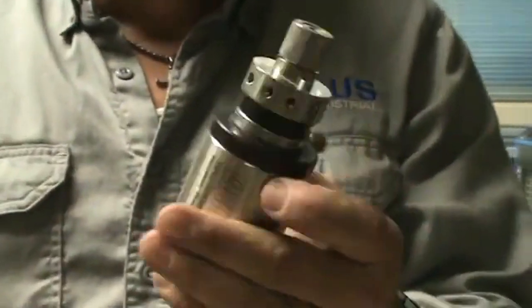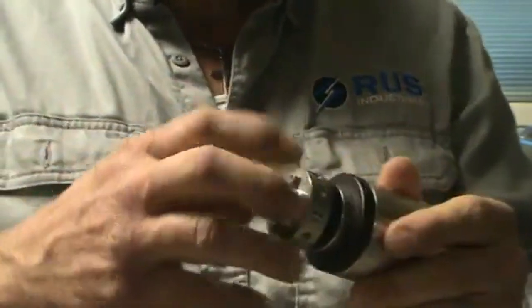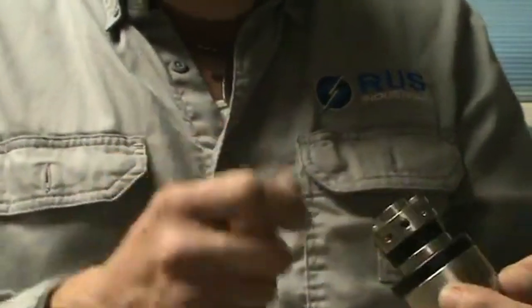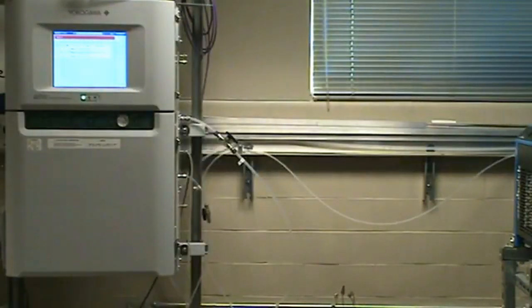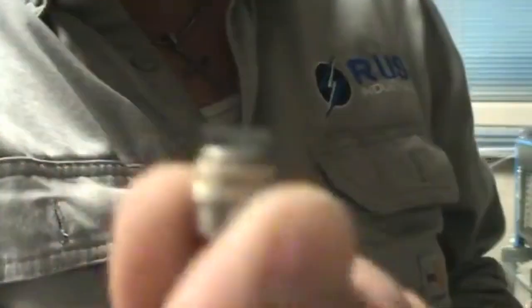Valco valves come with on or off, and then they come with a rotor. And inside of here, we're going to have this little guy. The inside of there goes back and forth, and that will connect these dots by the rotor.